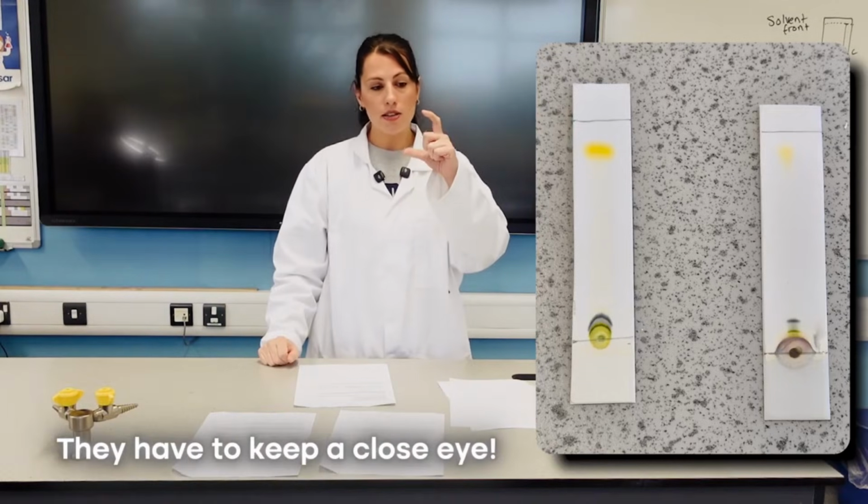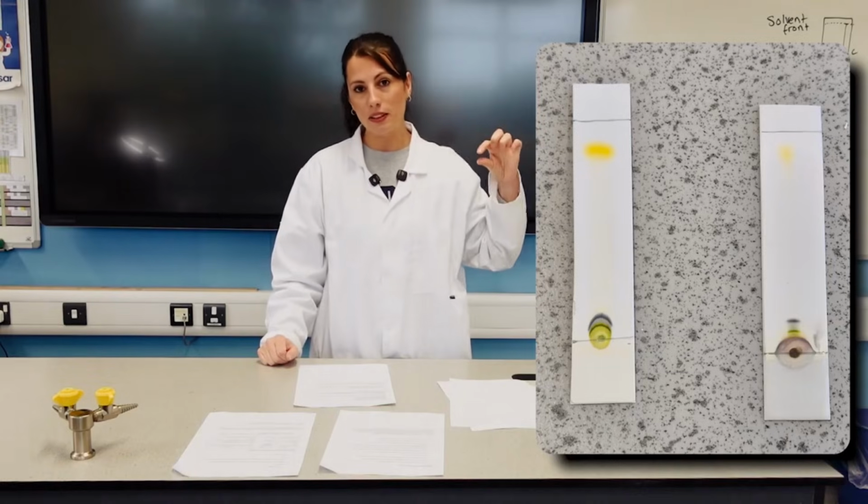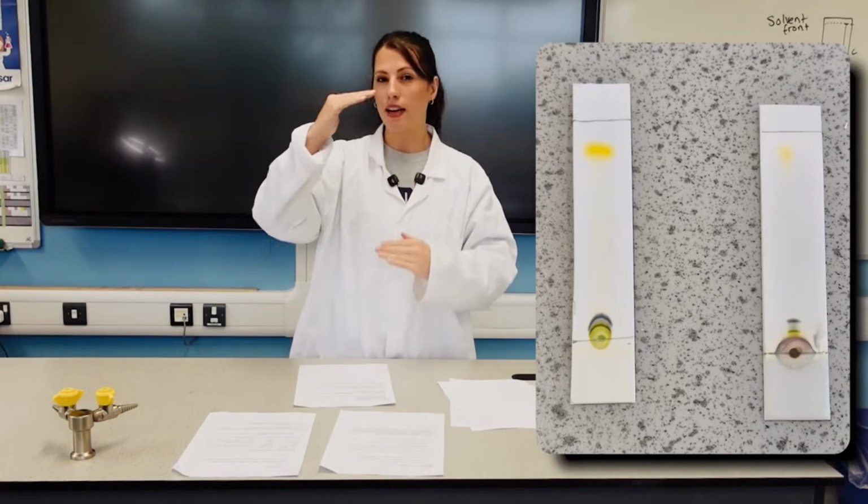They have to keep a close eye, because when the solvent does reach just before you hit the top of the paper, that's when they take it out, so that you don't get all of the pigments reaching that same end point and you don't have them separated.